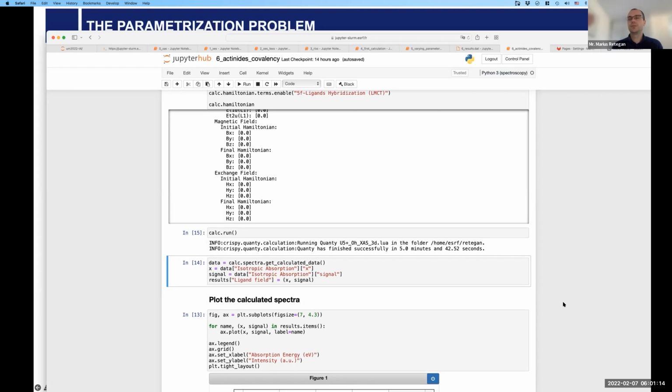So what to put effort into: what Matt Newville is doing and building upon his large library, because Larch can also be used like I showed today. But Larch as a library cannot do RIXS, cannot do X-ray emission. But it can do a lot of quick stuff. So this is what we are doing.